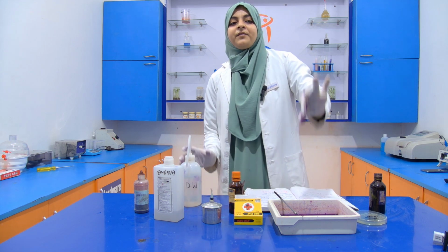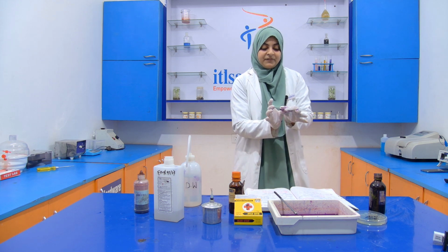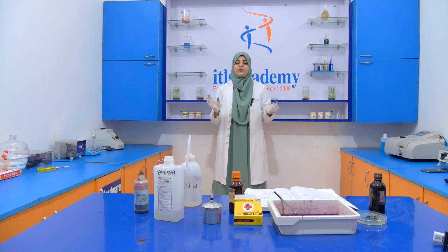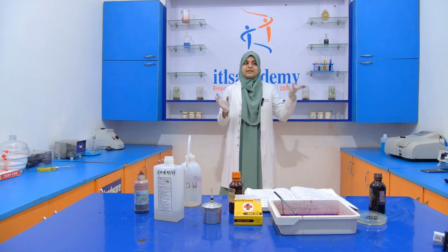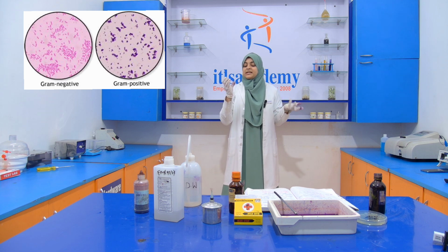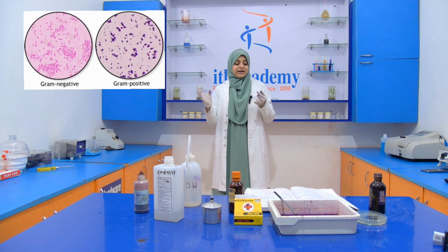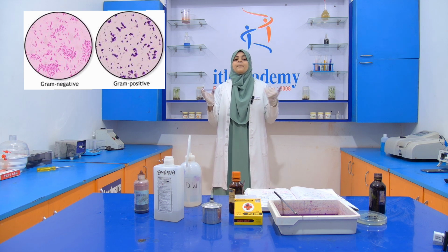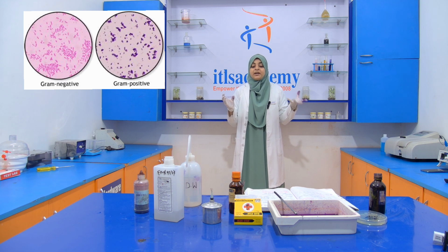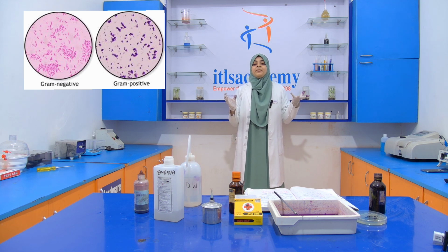Now after that, we have to air dry it, and after air drying it, we have to examine it under the microscope to see the staining result. If gram positive bacteria are present, then the cells appear a purple color, and if gram negative bacteria are present, then the cells show a pink color. Okay, so at the end of the video we will attach the image that we took from the microscope for your better understanding. This is all about gram staining.